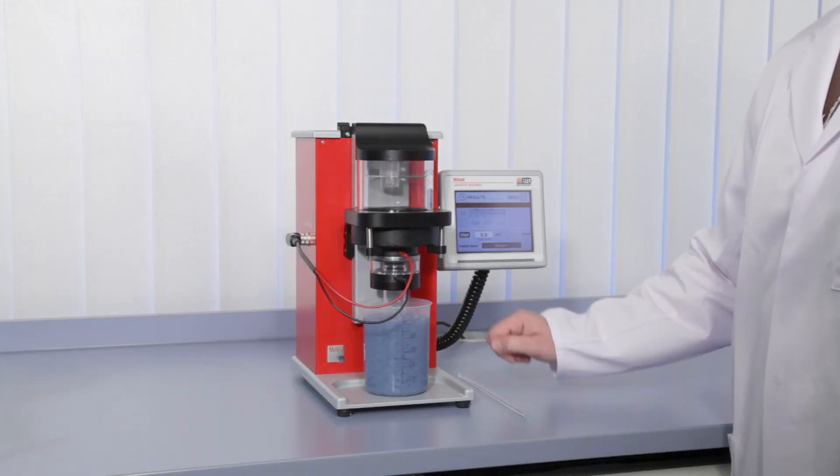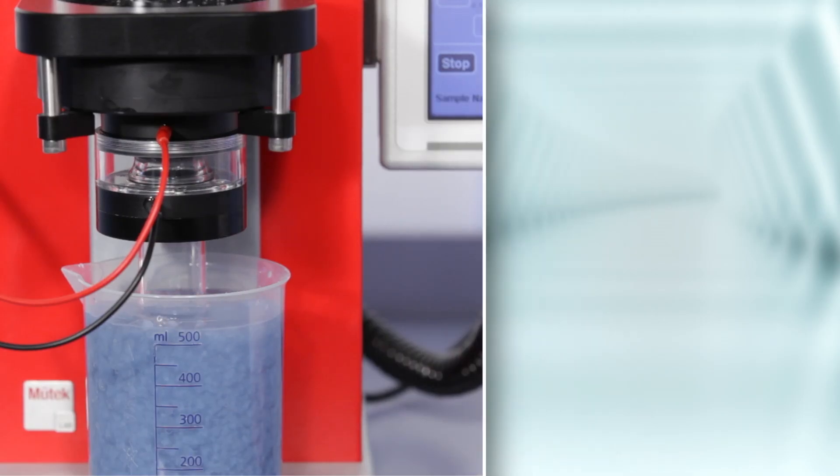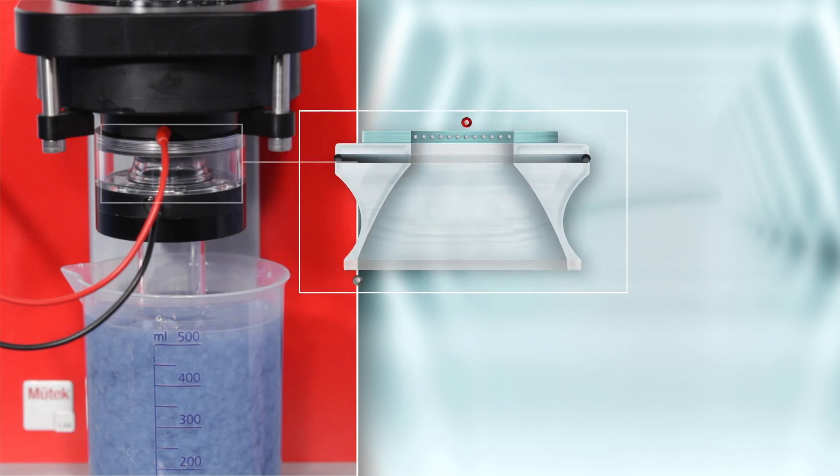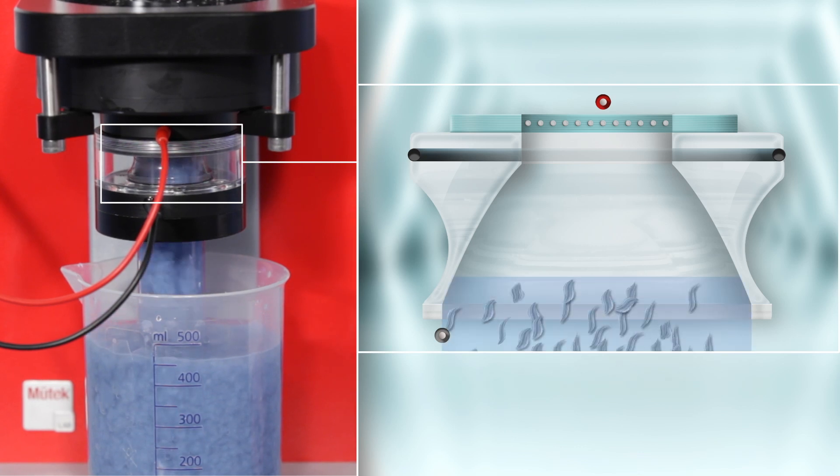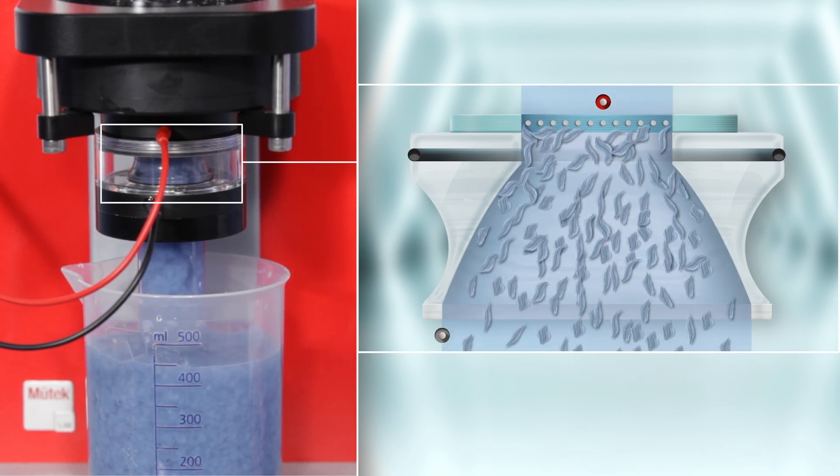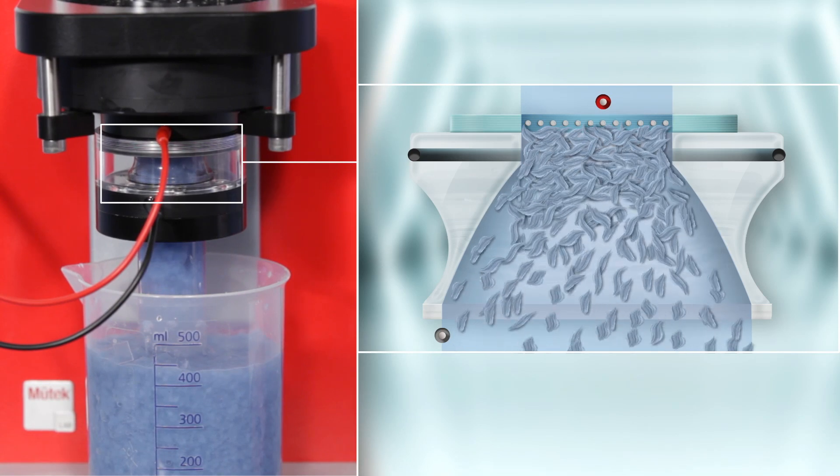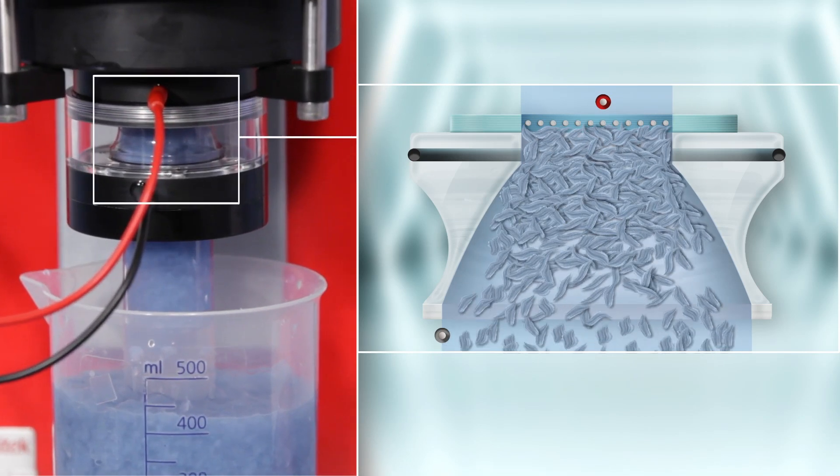Now, start measurement. Once measurement with the MUTEC SZP system zeta potential is started, the sample will be taken in from the beaker by vacuum, and transferred through the suction tube into the centerpiece of the measuring cell.